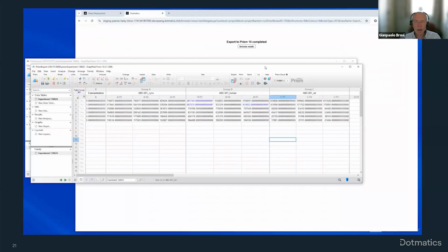As you can see here, displayed in blue. We can use this data now to try to generate a visualization like we had in the ELN.